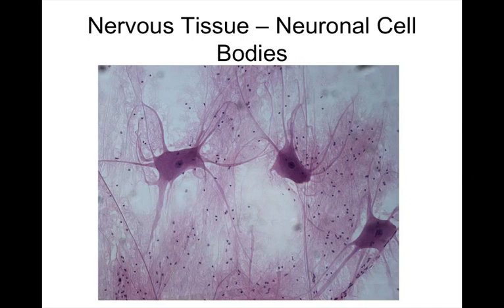Ooh, that's pretty. This looks like a science fiction thing or Cthulhu or something. So for nervous tissue, there are the dark-staining nuclei that you see around, which are the nuclei of the supporting cells, and then the cell body, which contains the nucleus and the cytosol, and then there are the axons that are seen extending from the cell body itself.